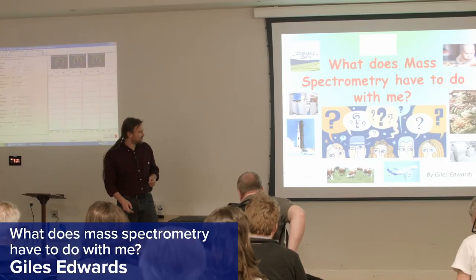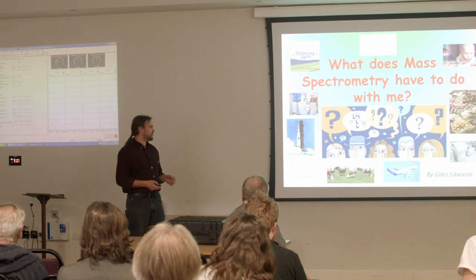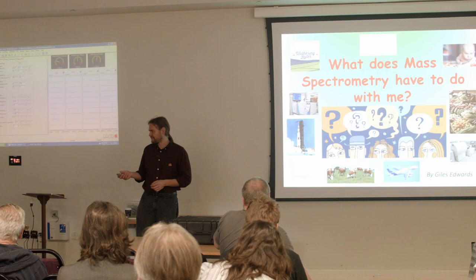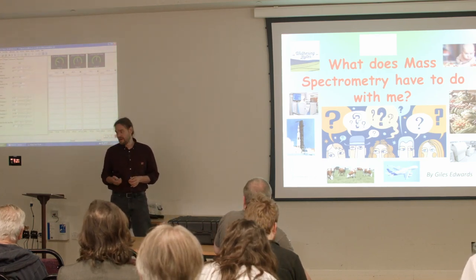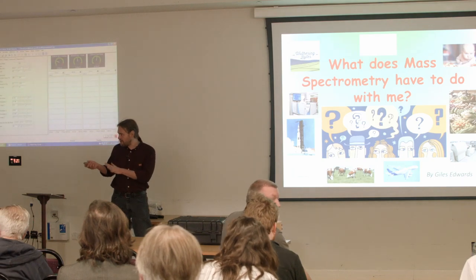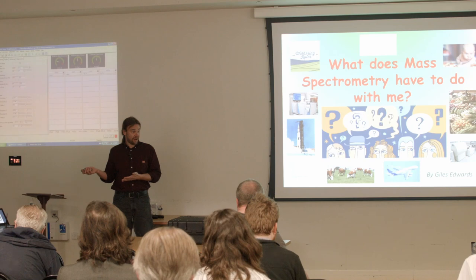My name's Giles, and I'm a mass spectrometrist. So what that means is I use mass spectrometers, which are these gadgets here, to determine the molecular weight of molecules. The reason why this has been whirring away and making all this noise is because it's got a very high vacuum system.